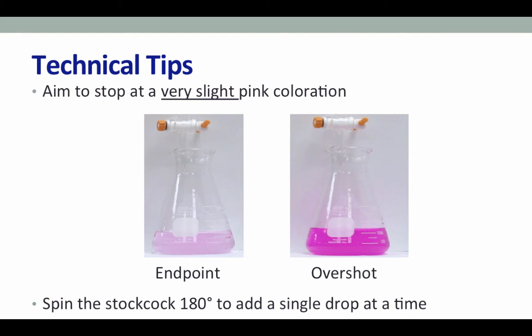Placing white paper underneath your Erlenmeyer flask can really help in judging when you've reached the endpoint, especially with the dark countertops in our Chem 1A labs. For the best titration, aim for a very slight pink coloration. If your solution looks darker pink, you have overshot the endpoint. To achieve the light pink coloration, add only a fraction of a drop from your burette at a time by spinning the stopcock a complete 180 degrees — this fluid motion results in less time with the stopcock open than turning 90 degrees and back.